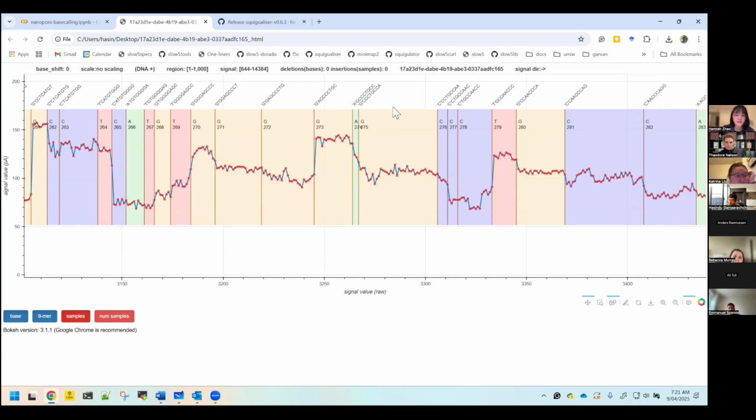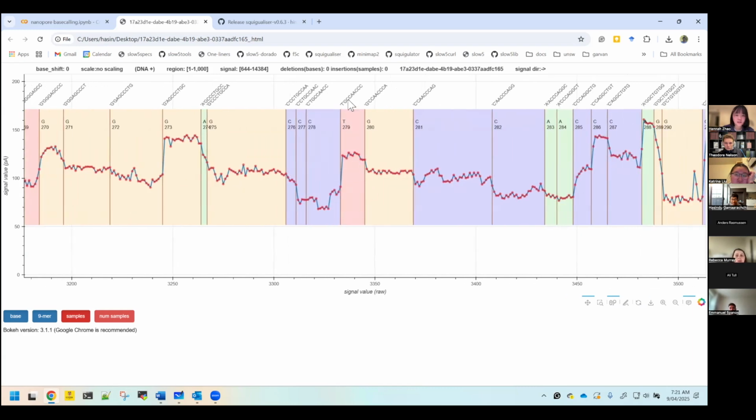Okay, so would the same two k-mers have the same signal? Approximately the same signal. Here you could see, right? Whatever this k-mer here has kind of similar values compared to the others, at a higher level, but it's noisy because this is a natural measurement.